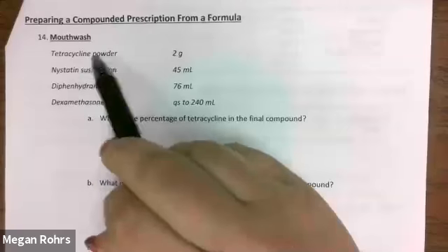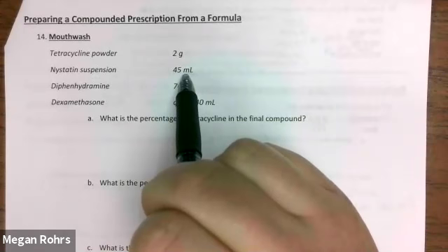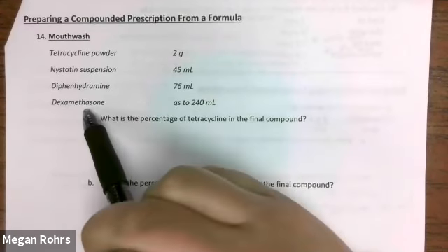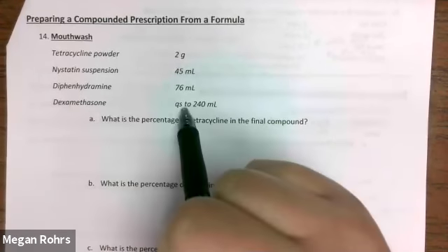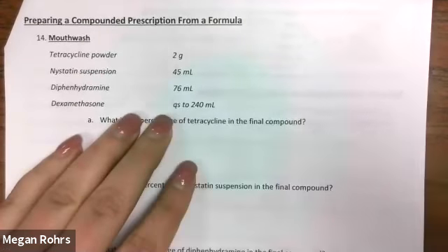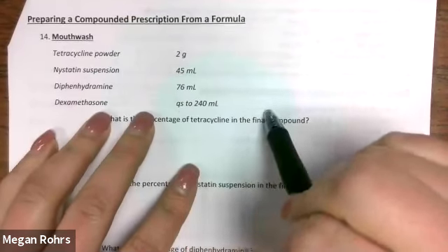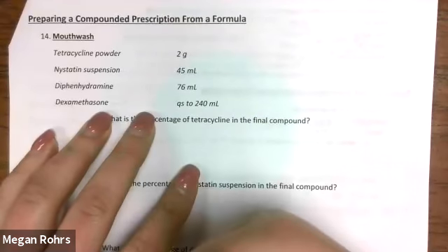We have 2 grams of tetracycline powder, 45 mils of nystatin suspension, 76 mils of diphenhydramine, and then we're going to QS to 240 with our dexamethasone solution. It's very important to understand that we don't know exactly how much dexamethasone we're going to be using. We're just going to be adding enough dexamethasone to get us up to that final 240 milliliters.